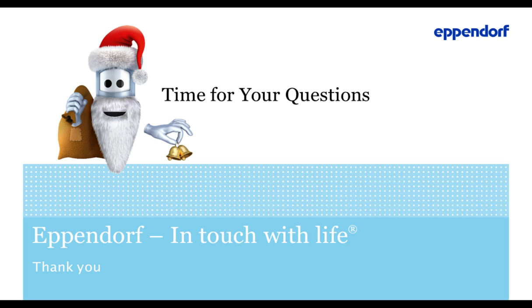Yes, I think I mentioned it in the first question already. Of course, you can also use antifoam in shake flask, especially when you work with baffles, that is helpful. And if you work, for instance, with very high speeds paired with high fill volumes. So, for instance, ultra-yield flasks have a higher filling and recommend to go to high speeds. So here it is definitely recommended and does not harm the cells.